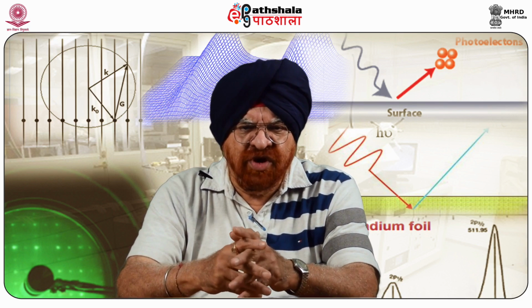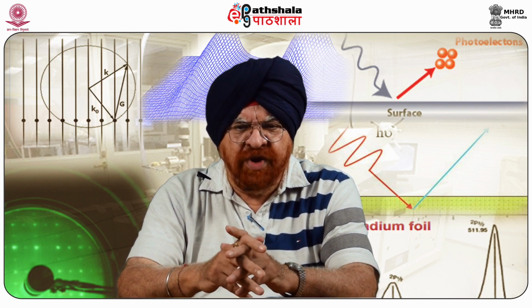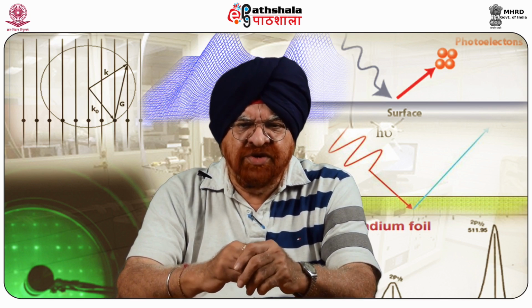Obviously, that is an electron kinetic energy analyzer, and photographic plates to record broad bands of emitted electrons as a function of velocity. In effect, recording the first XPS spectrum was the main thing in this. Continuing with this historical background, in 1954, the first high energy resolution XPS spectrum was recorded, which was of cleaved sodium chloride, revealing the potential of XPS. Before that, the actual potential was not realized.